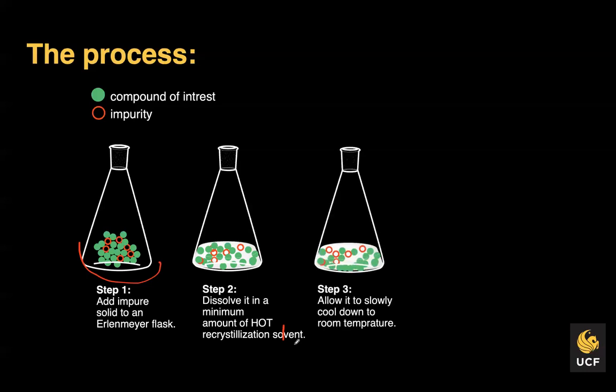All right, and then what you want to do is allow it to cool down slowly to room temperature. Cooling it down slowly is very crucial so that the crystals that are forming are those of the pure compound. The whole process is really an equilibrium process, where the molecules in solution are in equilibrium with molecules that are forming the crystal lattice structure.